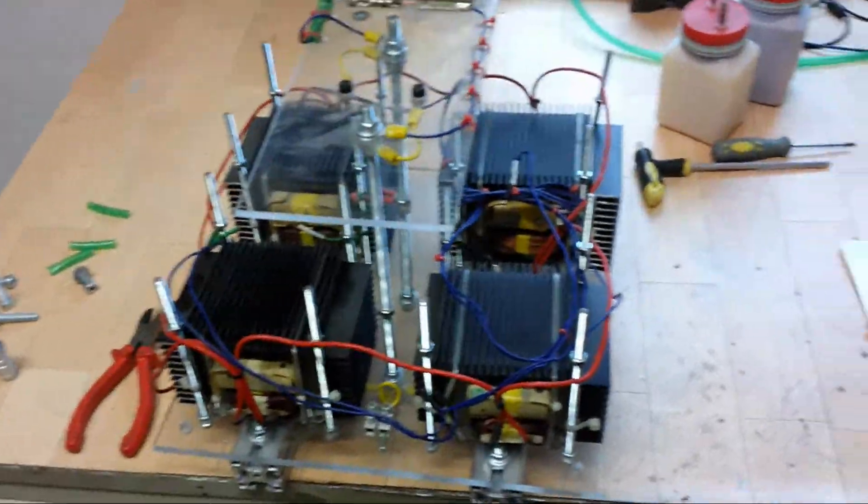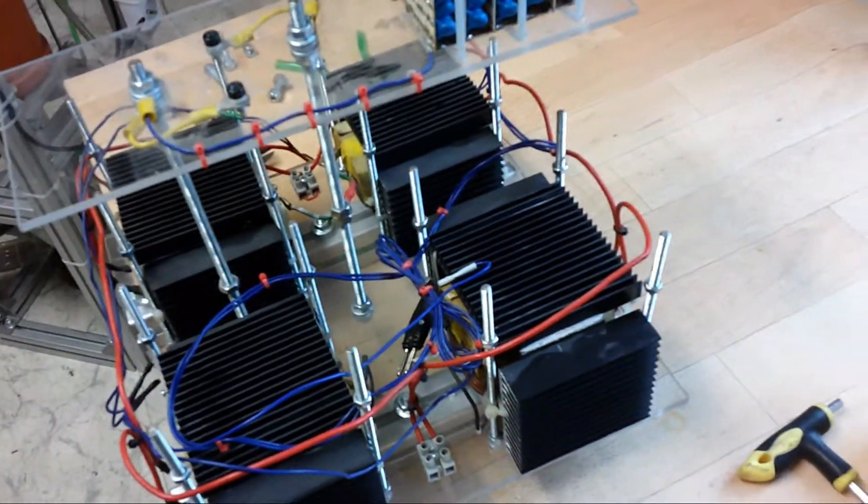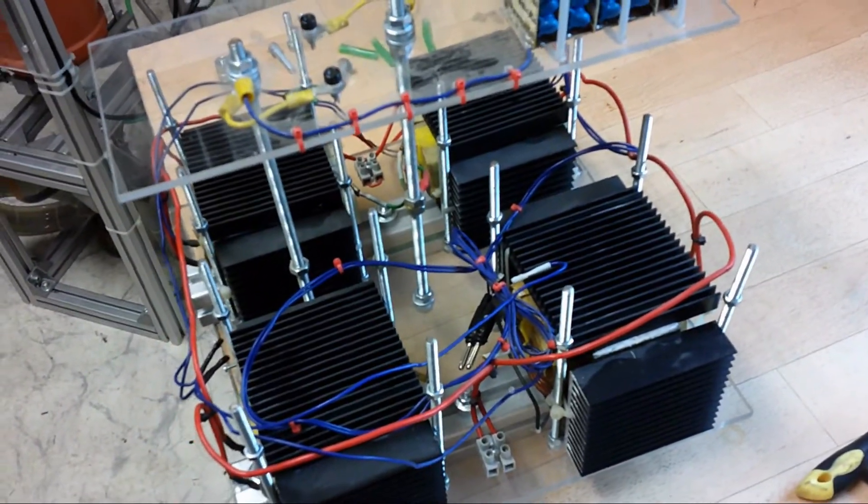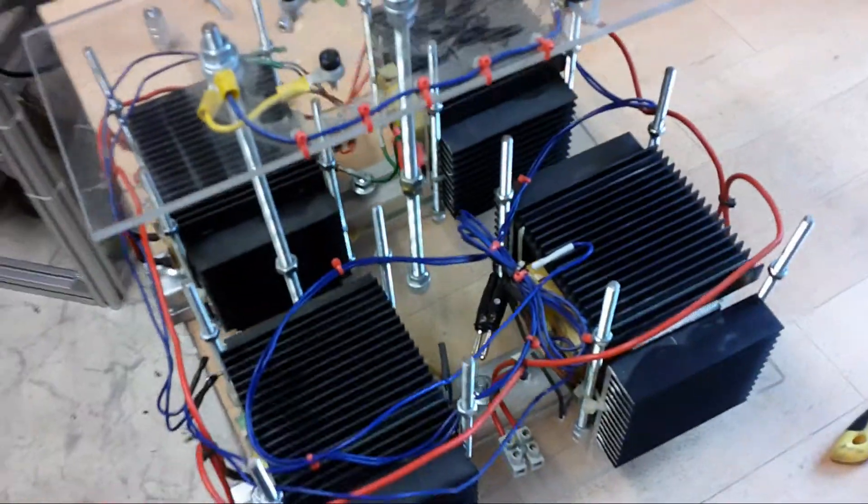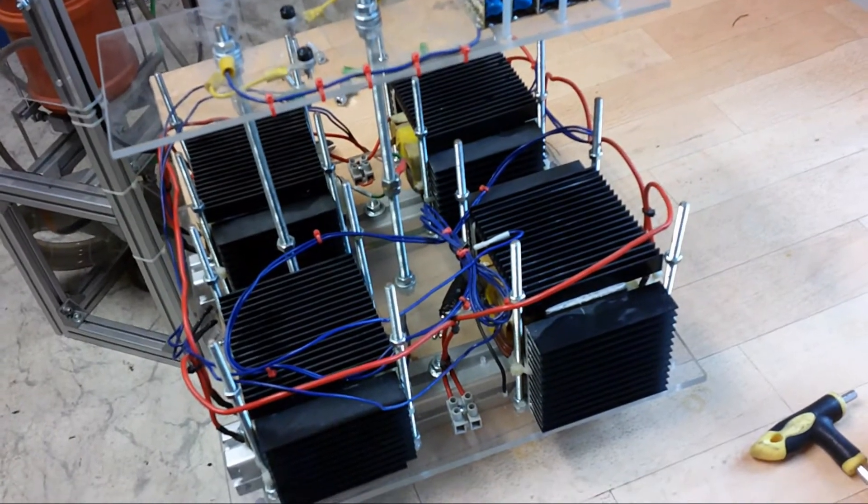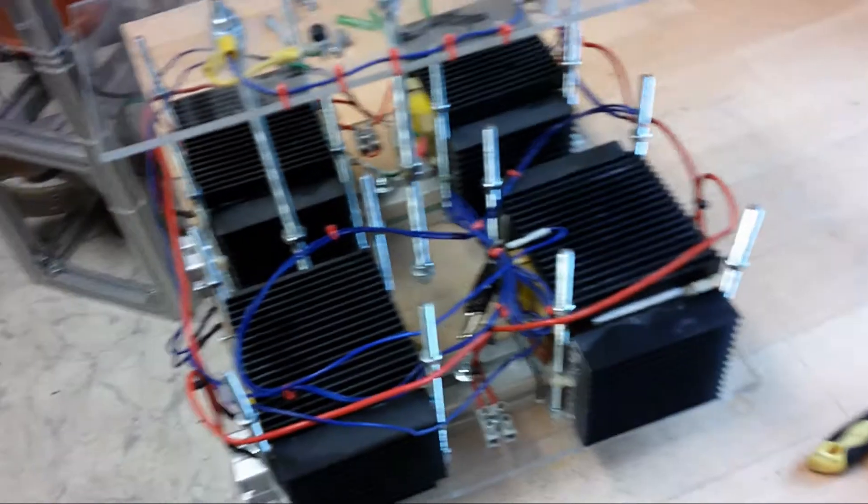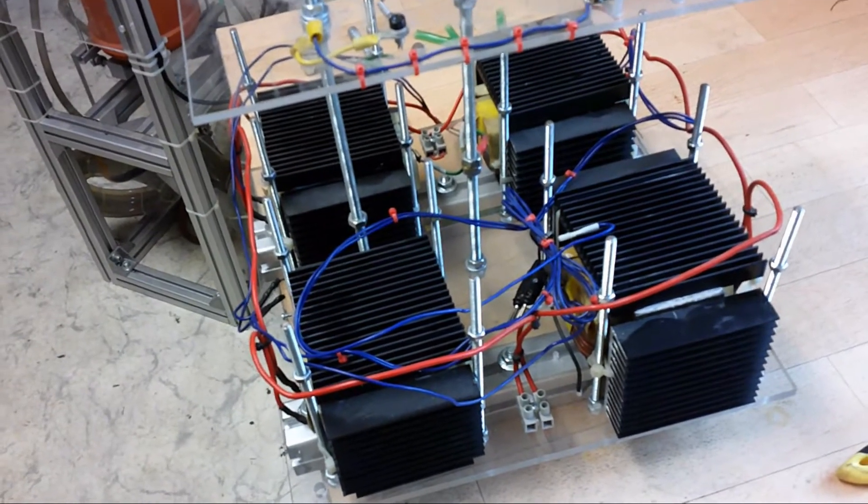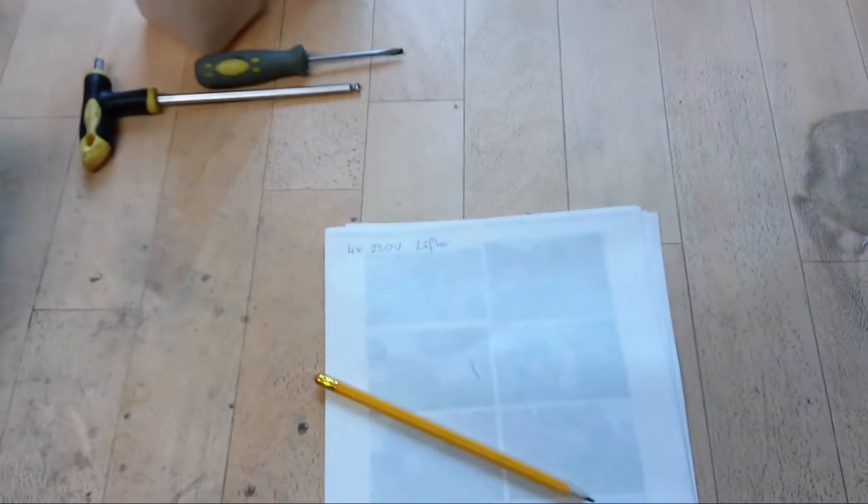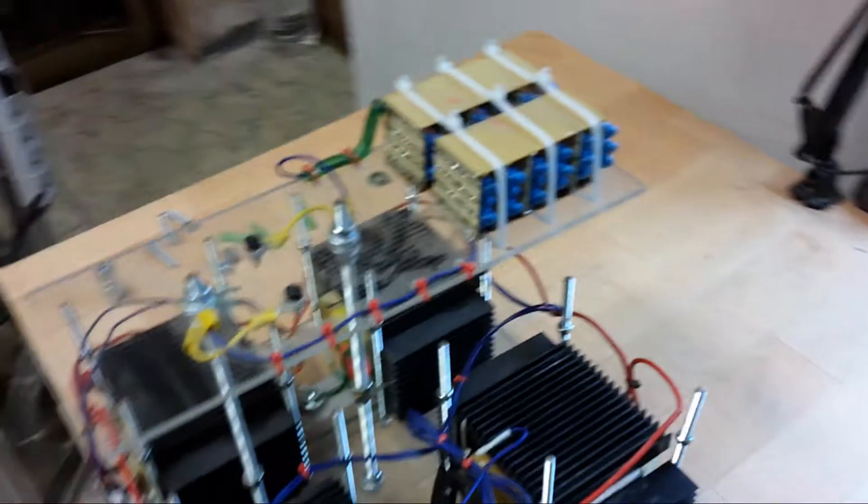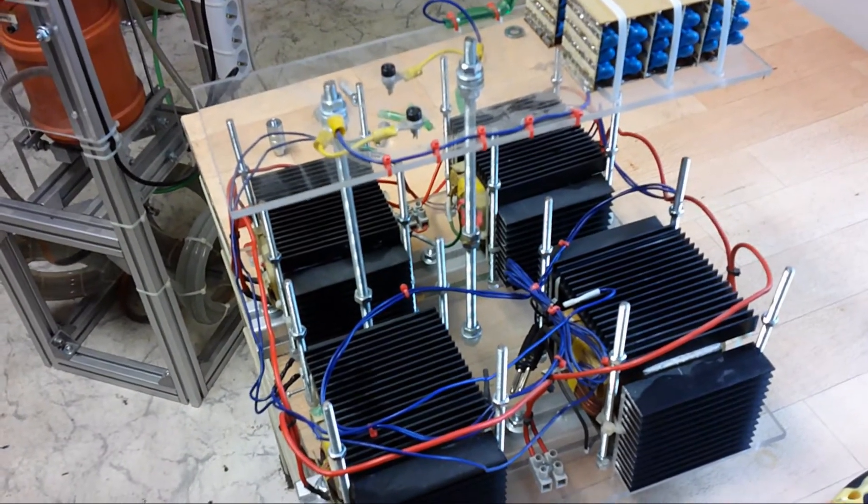So here I have disassembled the first part. That is, as I already told, the low-frequency high-voltage supply made out of microwave transformers. Apparently for other projects I have needed the coolers, so I have to buy new ones. Currently I am making a list of everything that I need to buy to make this device functional again.